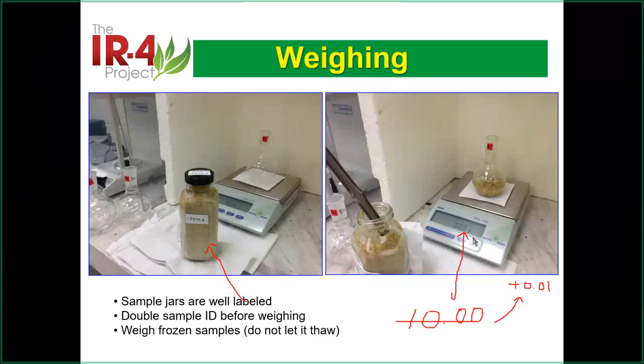And in the wintertime in Michigan, it's very dry. We leave it there probably 1 minute, we don't see any change because it's very dry. Outside is negative 20 degrees. Inside is plus 20 degrees. So there's very little humidity there. But you do the fast weigh while it's frozen. Frozen sample. So while it's frozen, don't let it thaw. Don't let it wait. Don't wait.